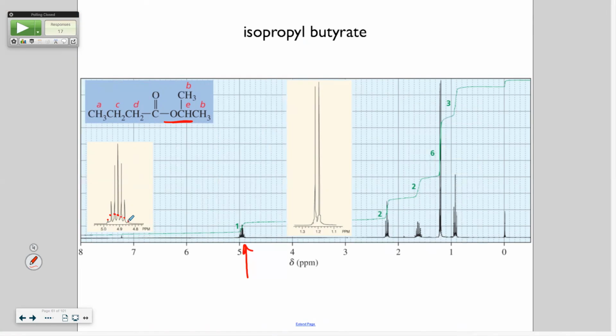So pull out your book and start looking at NMRs. Okay, all right, so what do you think this one is? That's a blow up, but which one do you think it's a blow up of? Well, look at the scale underneath here. What does that say? 1.2, so it's a blow up of this one. Okay, that's B's.